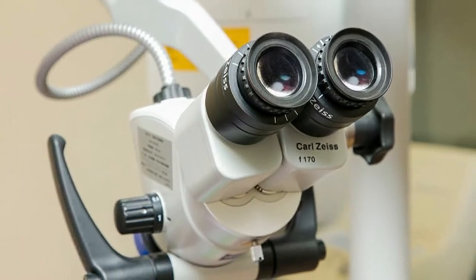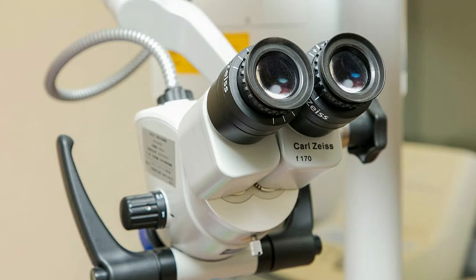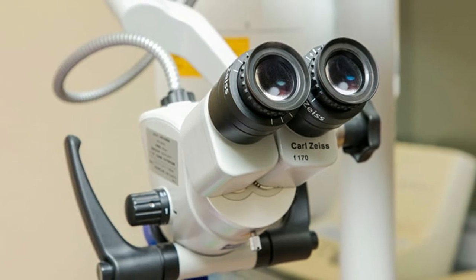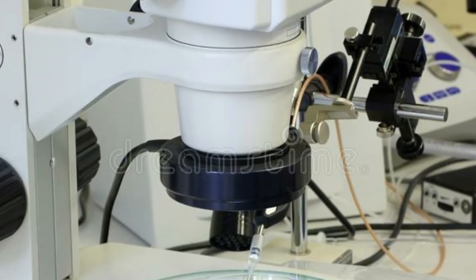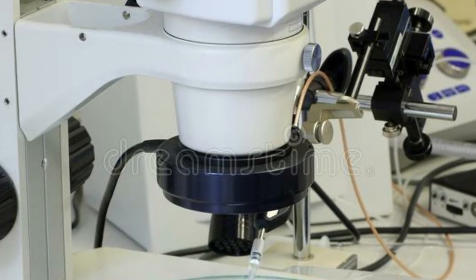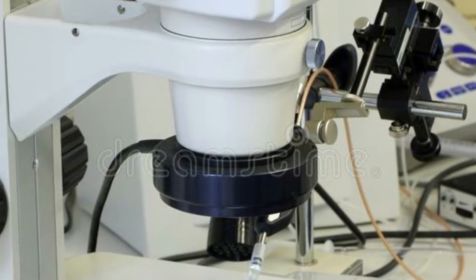As such, the user can either choose between incident illumination, where light is shone down onto the image, and transmitted illumination, where light is transmitted through the frosted stage plate. While incident illumination serves to observe 3D objects and specimens.